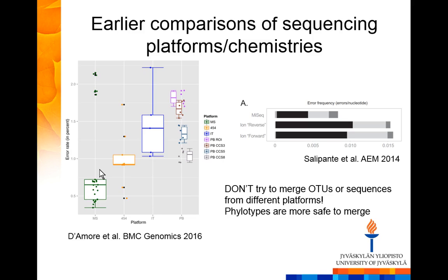But when you go to conferences, it's kind of annoying that everybody tells you in the presentations, just use MiSeq, Ion Torrent doesn't work. So I wanted to see what the quality is with the current chemistries, the most recent versions. Because I have seen with my own eyes that it has gotten much better.